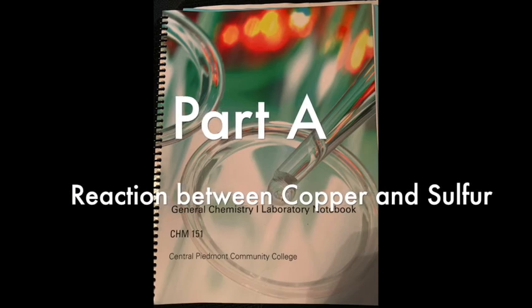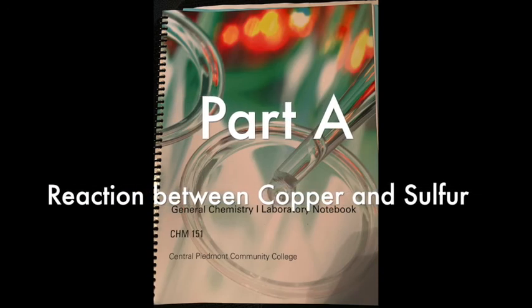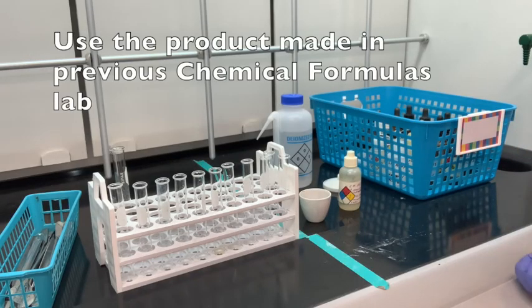Today's lab will be the chemical reactions lab. There's going to be a series of videos through several different types of reactions. What we're starting with today is the reaction between copper and sulfur. You do this reaction between copper and sulfur in the chemical formulas lab.